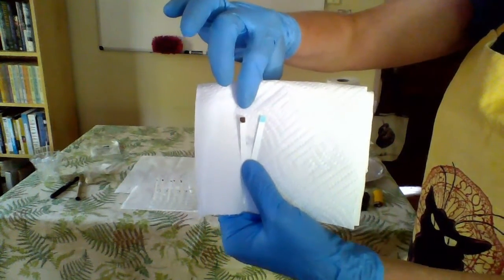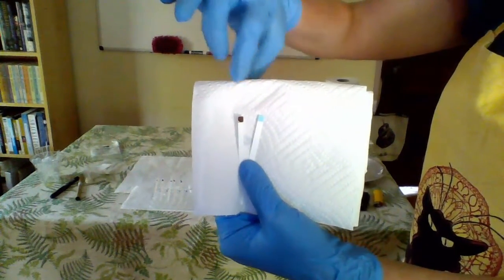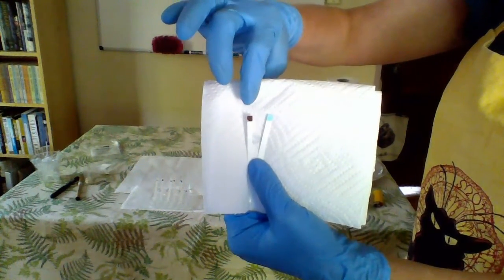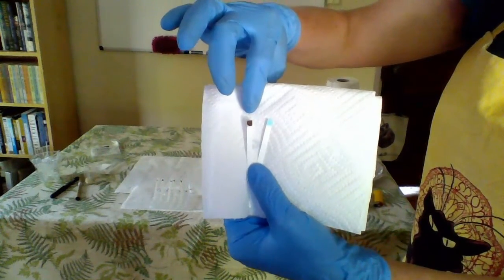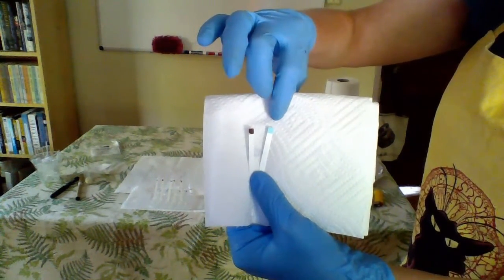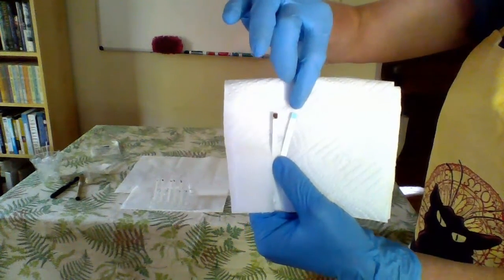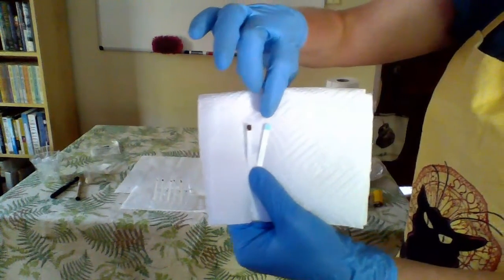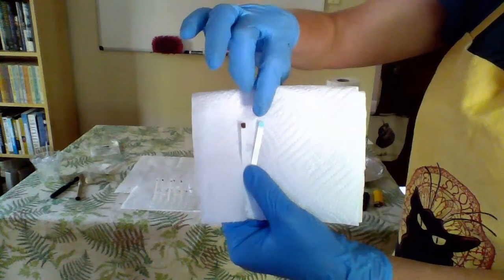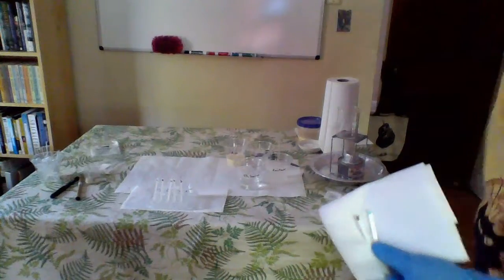When I compared it to the color chart, and what you'll have to do is click on the hyperlink within the protocols to get the color chart, this is telling me that I had a very, very high concentration of glucose, but I already knew that. That's why I tested it. And then here, I tested a solution that I knew definitely did not have any glucose. And so it did not give me a response at all. It's still the same color as the paper originally. It's almost the same color as my gloves. It is giving me a negative response.